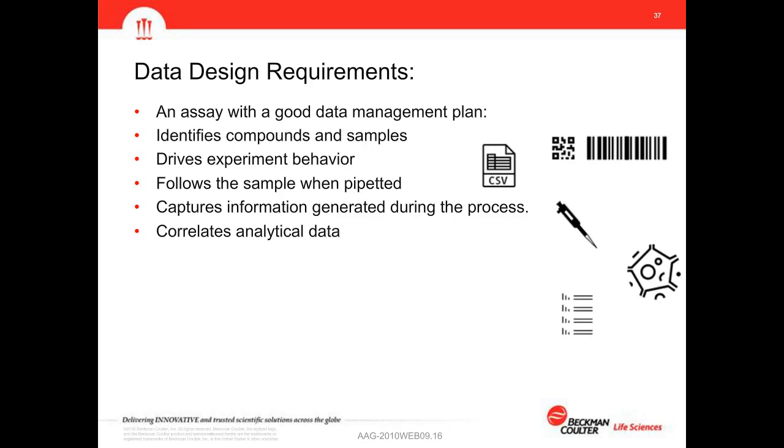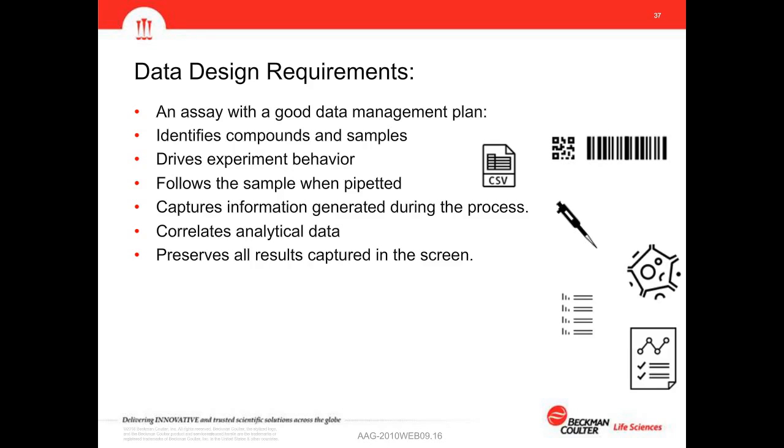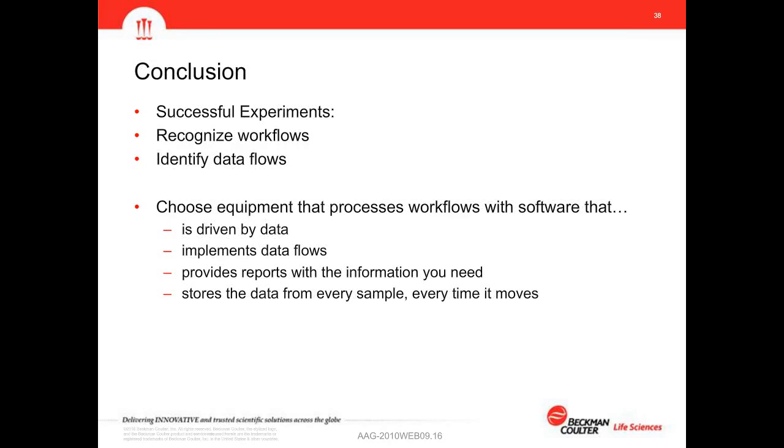You need to be able to correlate information. The ID and the results need to be side by side. And then anything that you have learned in the screen, whether it was produced in a report or not, needs to be retained and needs to be something that you've captured and can come back to. There might be some additional insight that as you return to this information, you can extract some sort of additional conclusion from information that you already have. That's where a data tracker can really be valuable.